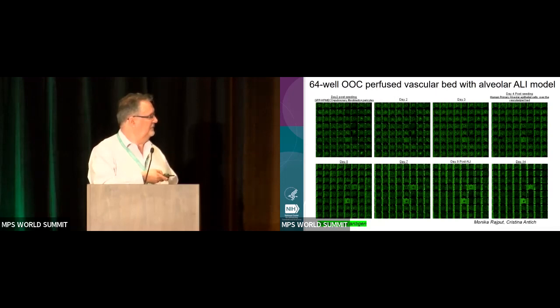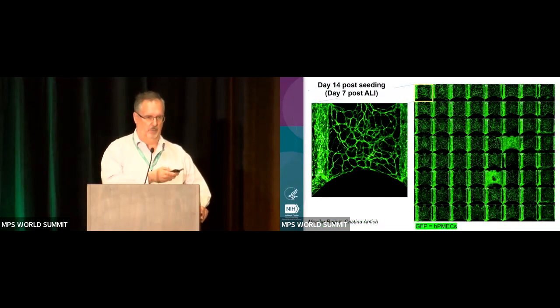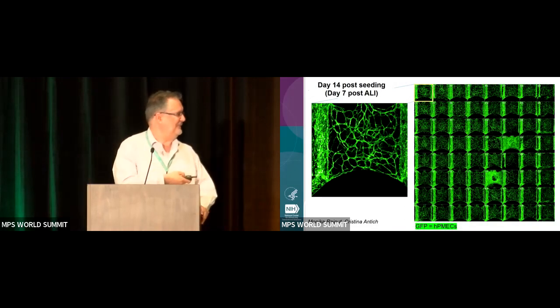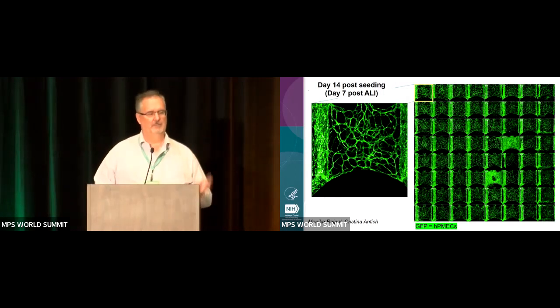We have some of the wells that we're still working on, but overall we can see, and this is the progression from the beginning until the ALI, I think it's day 14. And here is just a blow up of one of the wells. So you can see the endothelial cells in one channel, the other, and the vasculature. And this is the whole plate with a couple of wells here that I think last week they said they're coming up with protocols that look very good now. So scaling and reproducibility are important for us.